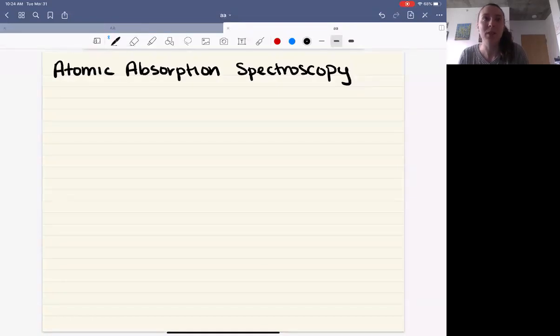Hi. So in this experiment, we're covering one new analytical technique that's very useful in chemistry called spectroscopy, and also introducing another calibration method, the external calibration method. So spectroscopy. This relies on the interaction between light and matter.